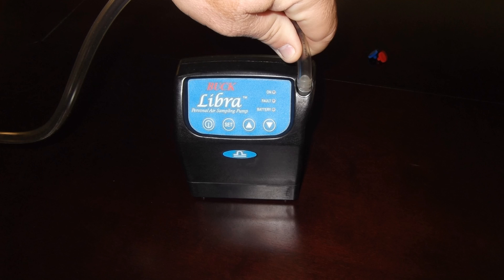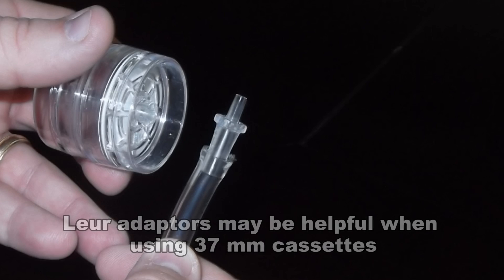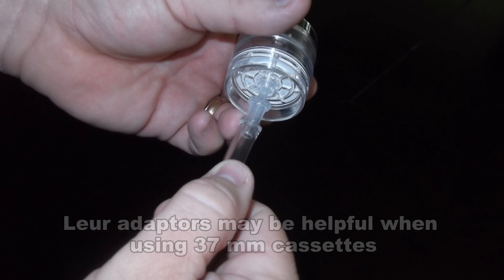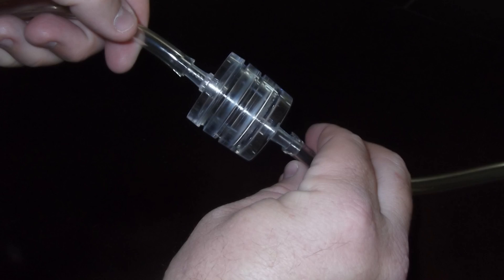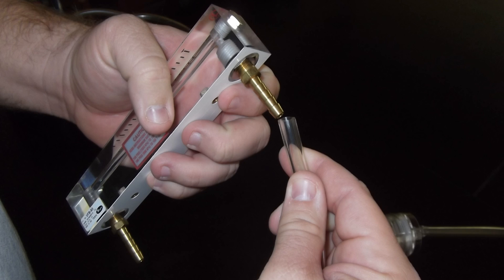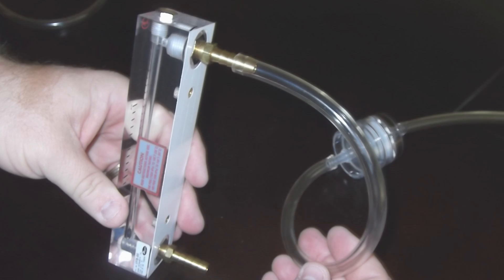Then connect the pump to the sampling media. When using 37mm cassettes, lure adapters may be helpful with tube connections. Connect the inlet side of the media to the tubing and connect the other end of the tubing to the hose barb on the vacuum side of the rotometer, which is also the top.